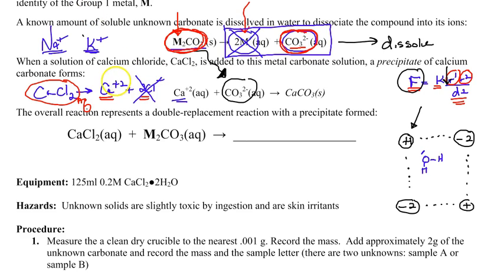But the calcium +2 has a what? Large charge. And again, the carbonate ion, -2, a large magnitude of charge, is going to increase my force of attraction. So this calcium +2 is going to be attracted to the carbonate that came from our soluble metal carbonate to make a precipitate.